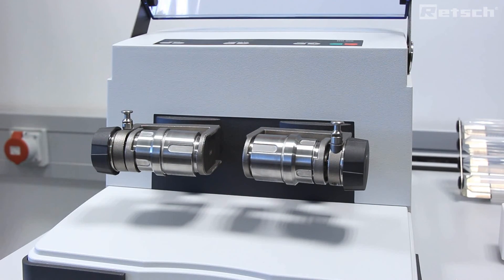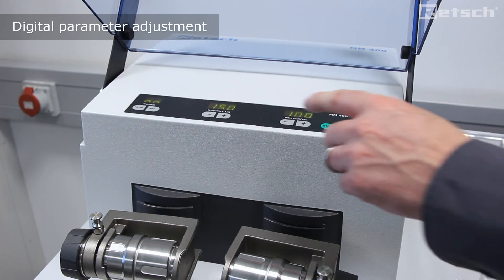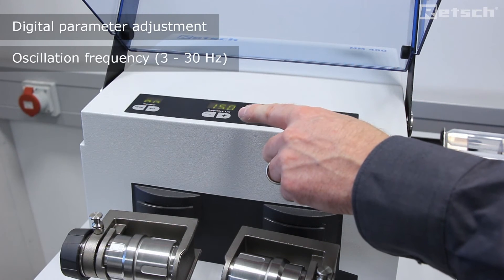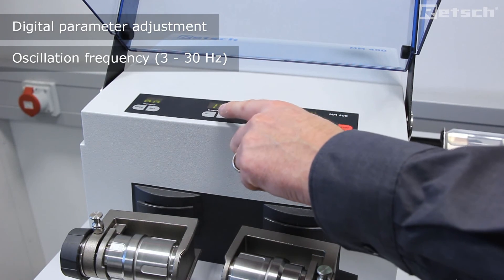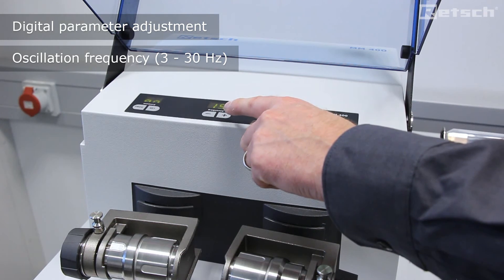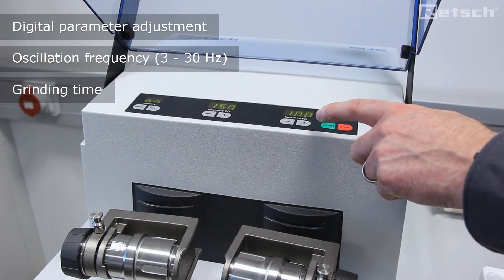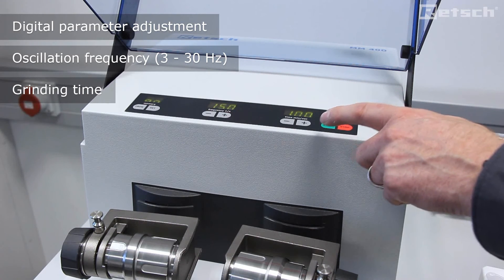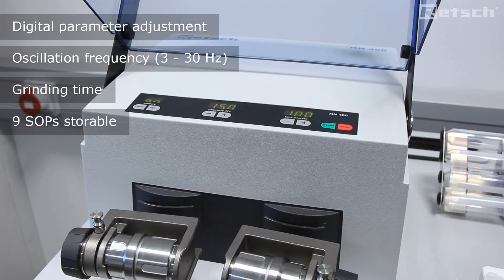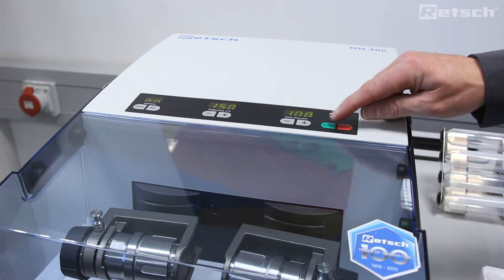The MM400 has two grinding stations so two samples can be prepared simultaneously. We can simply adjust the frequency of oscillation using the plus and minus buttons in a digital manner, which allows for reproducibility. Furthermore, the time in minutes and seconds is also digital. Once both grinding jars are secured tightly, we simply put the Perspex lid down and press start.